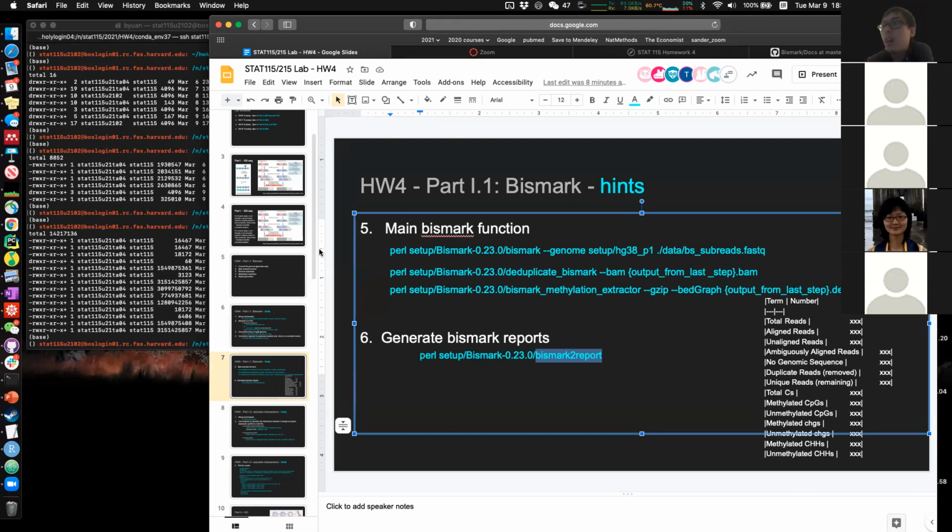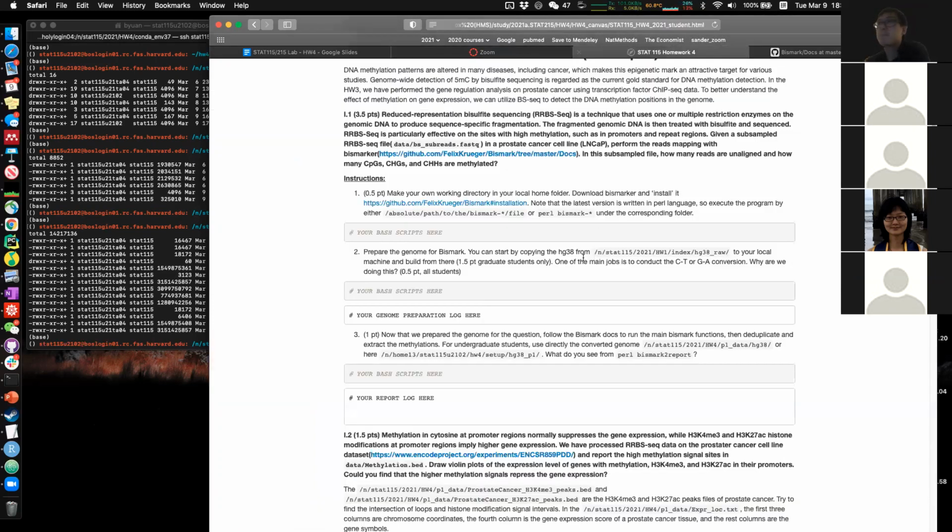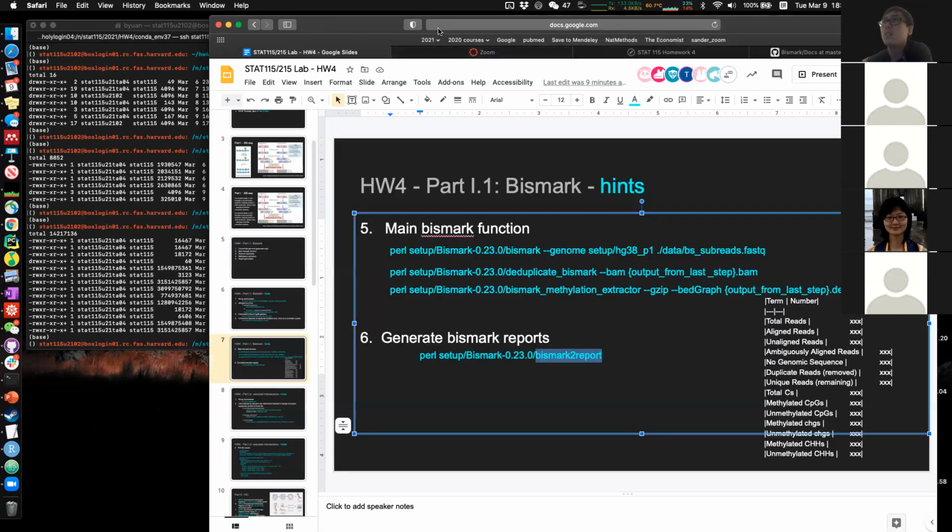Okay. So that's all we have for part 1.1. Any questions so far? Okay. If not, let me just pause this recording so that it can be separated into sections.